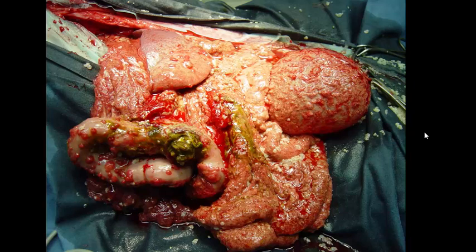Selection A is Diphyllobothrium species. B, Mesocestoides species. C, Spirometra species. Or D, Echinococcus multilocularis. Here's a hint. It's the cestode special of the day. Tissue from a dog. Which one is this? Okay, time's up. All these are cestodes. The correct answer is Mesocestoides.